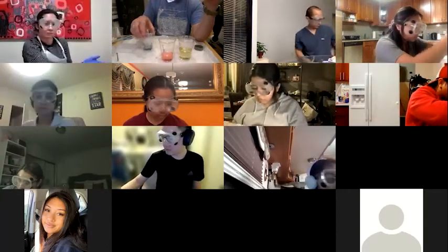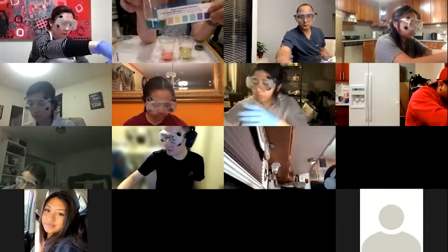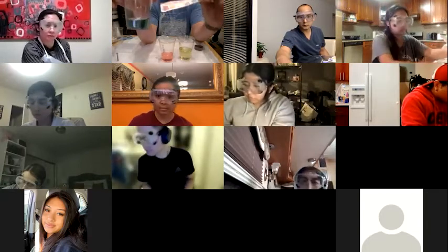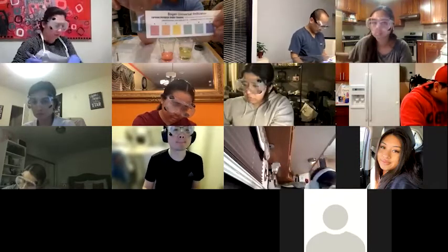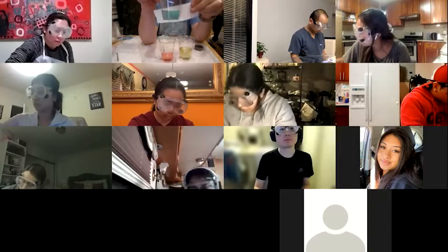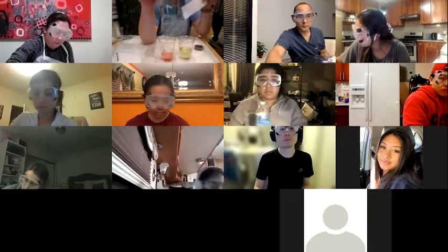And then our acetate looks to be around pH 8. So pH 8 is right here. pH 9 is a purple color, and it doesn't appear to be purple. It looks more blue to me than purple. So I would give that a good pH 8.